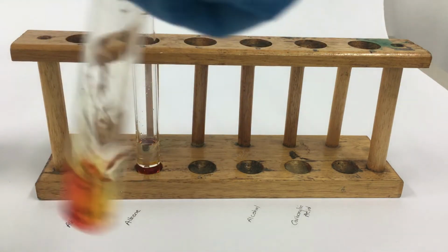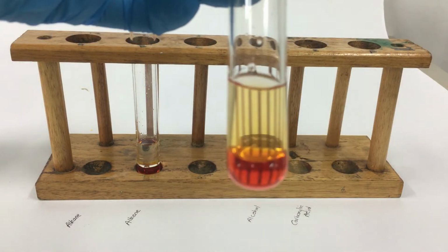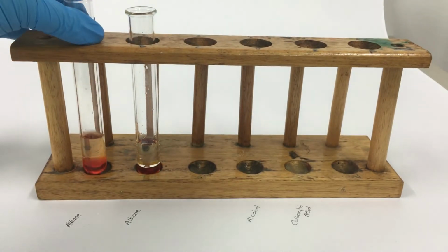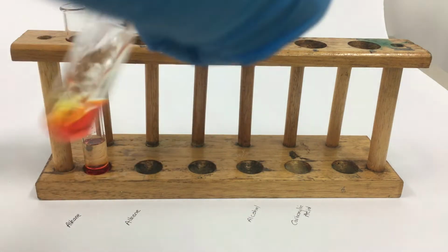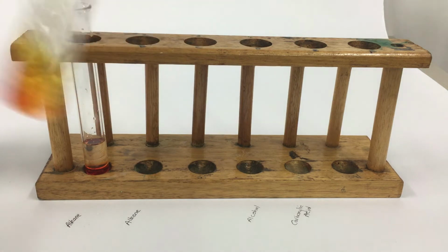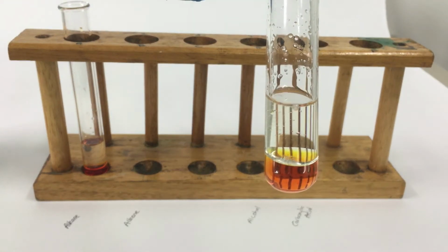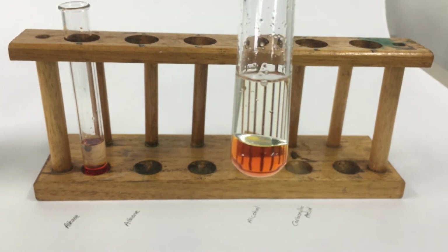So the alkane here, give that a swirl. I'm getting a bit of orange colour into the water. That's just the bromine dissolving in the water there. But we're still getting quite a distinct separate layer. The alkene, let's have a look. Now at the moment it's sitting like that. Still a very distinct separate layer on the alkane.